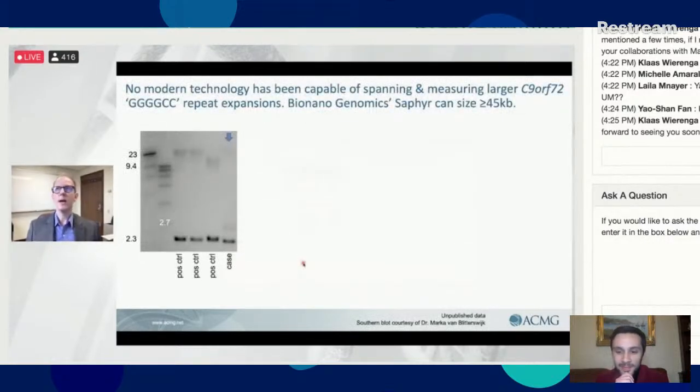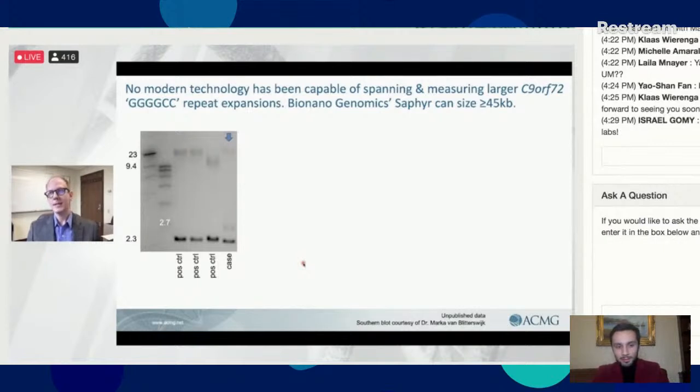So to this point, I've shown the long-range sequencing technologies, but there's another technology that I want to introduce that has a lot of value, and that's the Bionano Genomics Saphyr. It's not technically sequencing; it's optical DNA mapping. All of these technologies are excellent at identifying structural variants, and structural variants are critical and are a major player in disease, as I will demonstrate here.